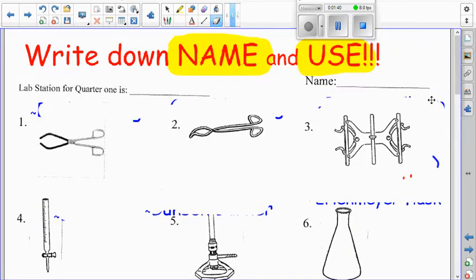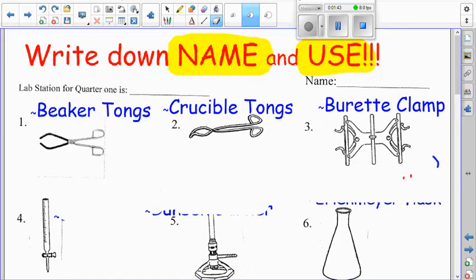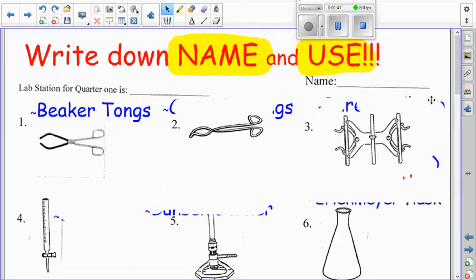Number one, beaker tongs. Oh, and there's the other two, I guess. Erase it for now. Beaker tongs. One of the most common objects you will use in the laboratory this year. Here they are. They're kind of shaped like a pear. You'll notice that they have rubber on the ends. Right here for you kids at home, that is rubber. Beaker tongs, that's what it is, what it do.